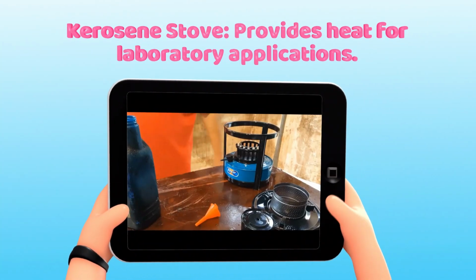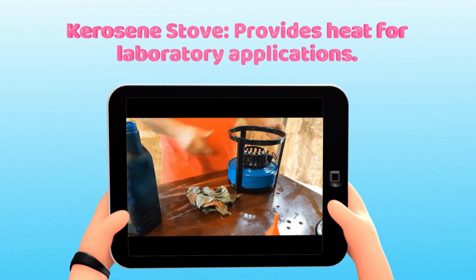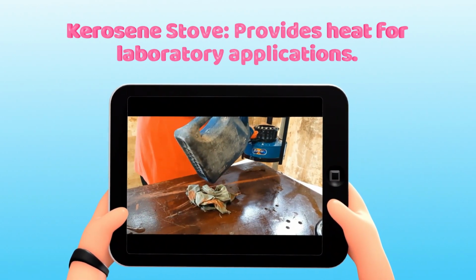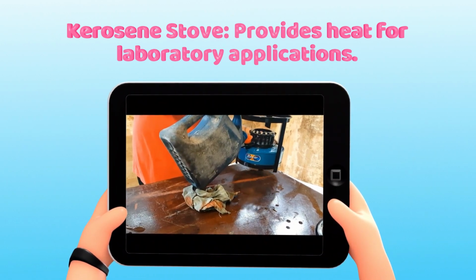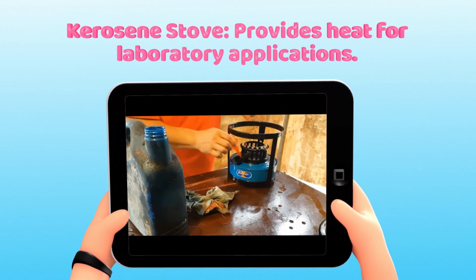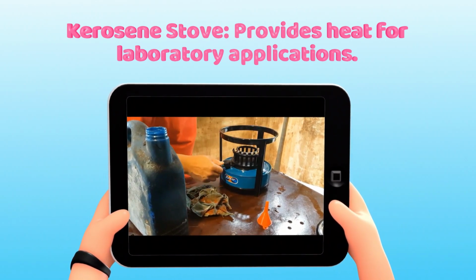Another type of apparatus used in the laboratory is the kerosene stove. The main function of this stove is to provide heat for laboratory applications. As you can see from the screen, that is how we set and operate the kerosene stove.